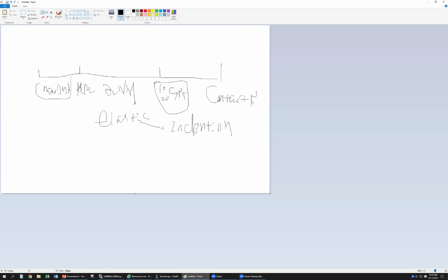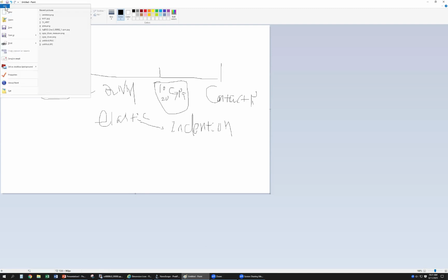Okay, clearly. So that means if too soft, QNM is not suitable. Very hard, QNM also not suitable. Okay, that's all for QNM. So the first curve where I wrote down there. Then this one is a new one.